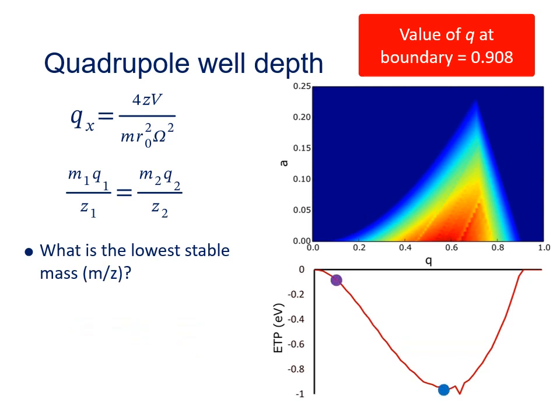But now, let's imagine a situation where in our initial mass spectrum we have the ion of mass to charge 500 at a Q of 0.6 that we already discussed. But what if we also have an ion of mass to charge 3000, which will therefore have a Q of 0.1? Now you can see that the trapping well depth for this new ion is much, much lower. So if we want to boost the sensitivity, what will we do?